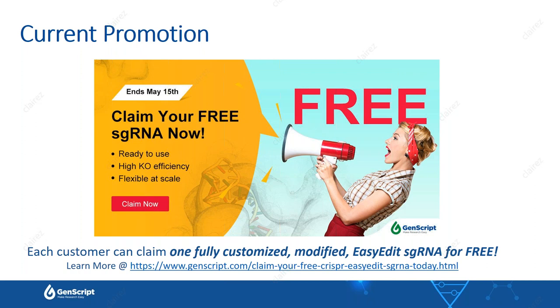Claire, do you want to add anything to that? So for RNP, they're basically lipid-based transfection methods, just as how you transfect plasmids, or there are microinjections or electroporations, and also nanoparticle-based delivery. There are several different ways people use it. More depends on the model you're working with, like the cell line, the embryo, or is it like in vivo injection, etc.